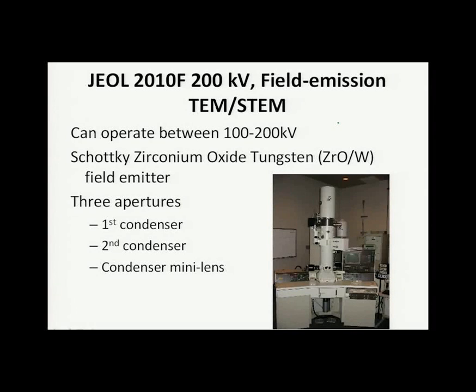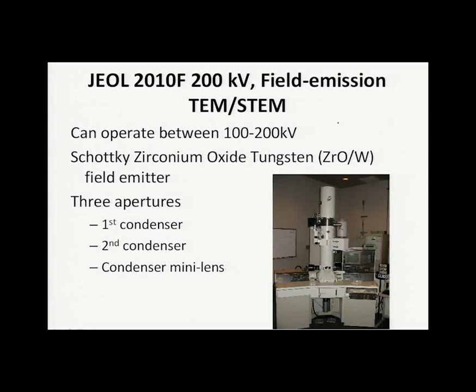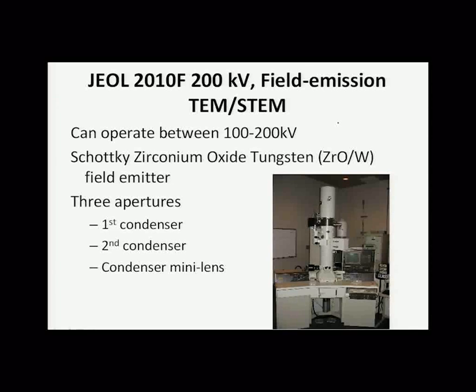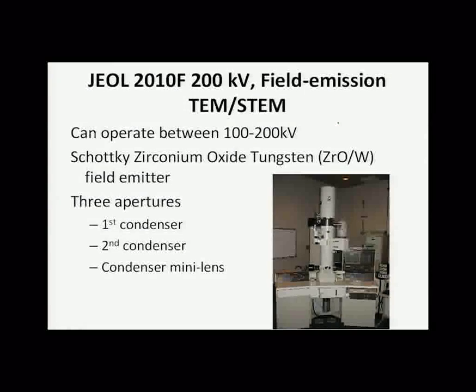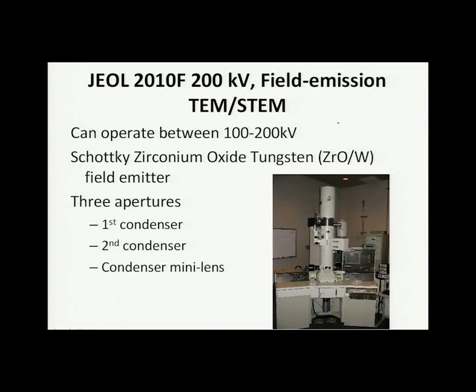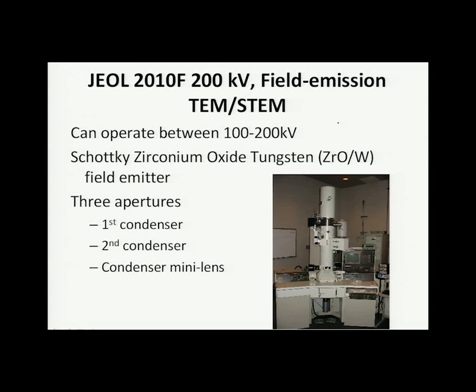So you can see, a tool operator would sit in front of the tool. Just to give you an idea of size, you could fit a desk chair in that region in the middle, and then the column might be 6 to 8 feet tall, including the height of the desk there.